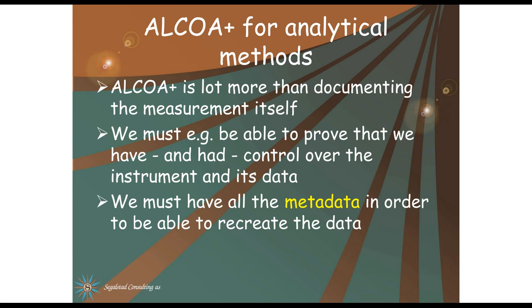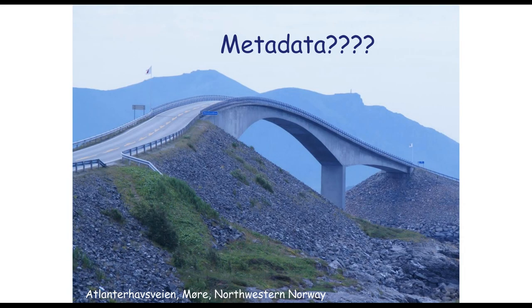Let's look at an analytical method or two and see how we can implement them in order to be in compliance. Because the ALCOA-plus is a lot more than documenting the measurement itself. We must, for example, be able to prove that we have and had control over the instrument and its data, and we must have all the metadata in order to be able to recreate the data later.